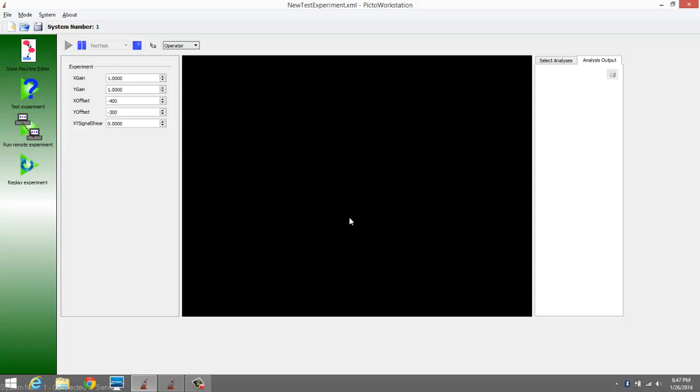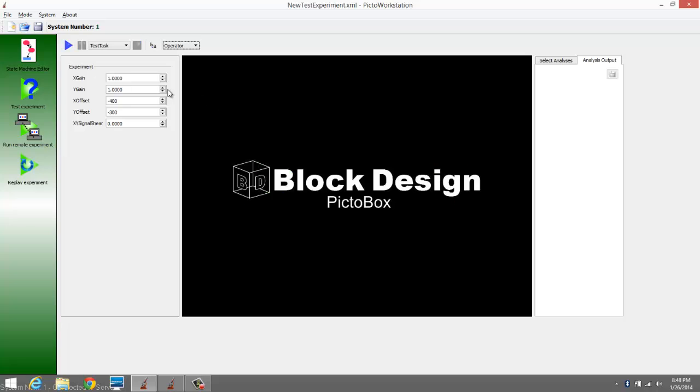And there we go. We have the two different targets appearing. If I don't fixate, they just disappear. If I do fixate, then you hear that click. Hopefully you could hear that too, and that click indicates that a reward was supplied. So that's it. Twice there, say we'll go once here, and that's going to be the end of the task.